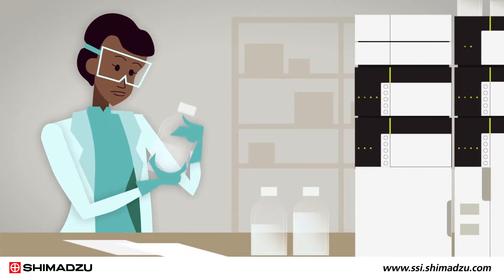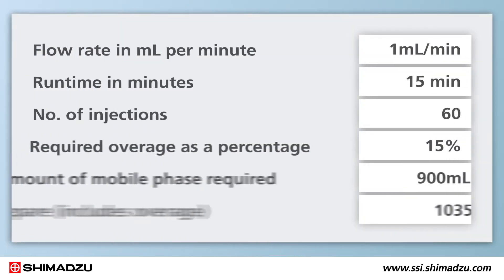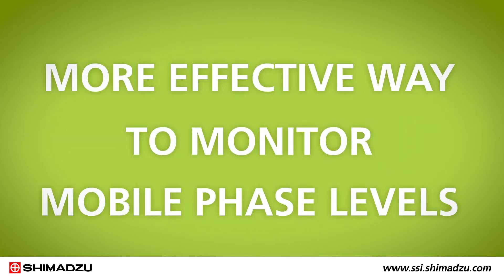Up until now, laboratories have had to estimate the amount of mobile phase required for analysis before starting the batch run. But these calculations take time and leave room for human error. Fortunately, there is now a faster, better, and more effective way to monitor mobile phase levels.